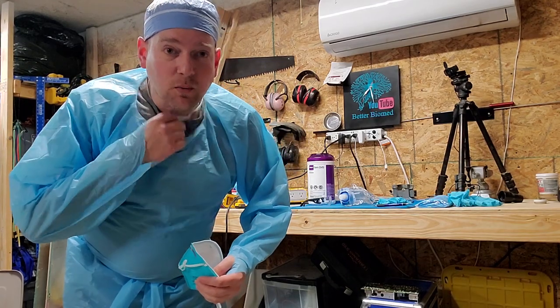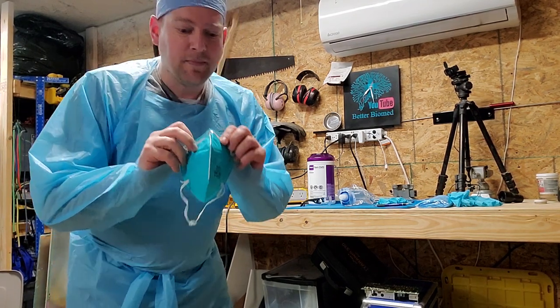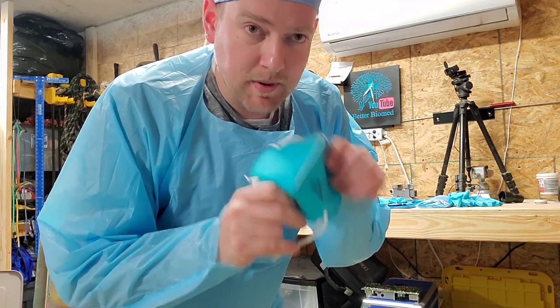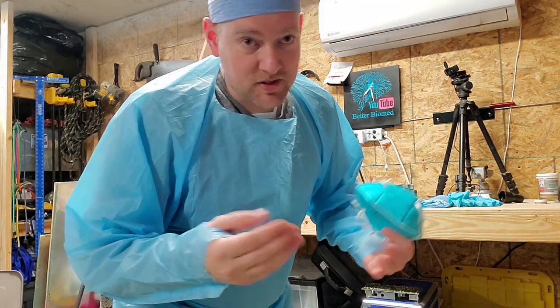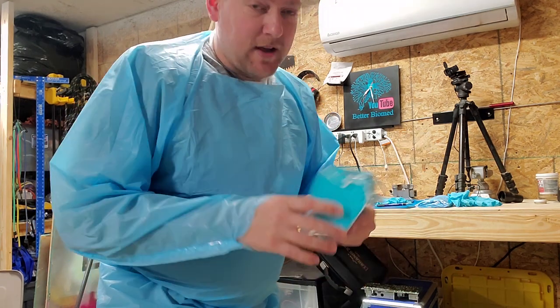After you have your mask tucked away, nice and safe, that's when you're going to grab your N95, and there's going to be a metal strap up near the top. That strap is going to be what forms the mask to your face and gets a tight seal. And as you can see, I have some stubble. So I wear this duckbill style face mask, and it applies a much tighter seal. Now I keep my facial hair very short. Often I shave it, especially if I know I'm going to be doing PMs or something in or around the COVID wards. I shave my face, but because right now I'm not going to be around them, I do it this way.